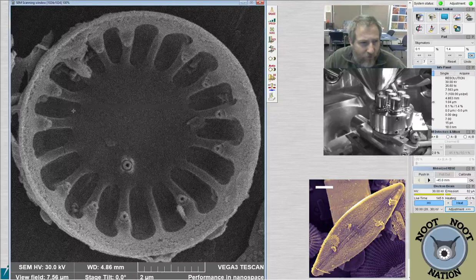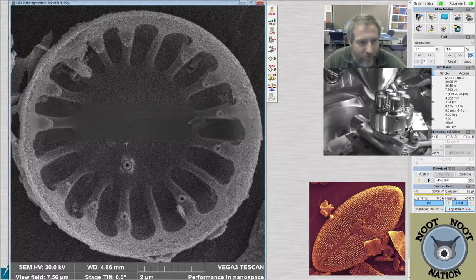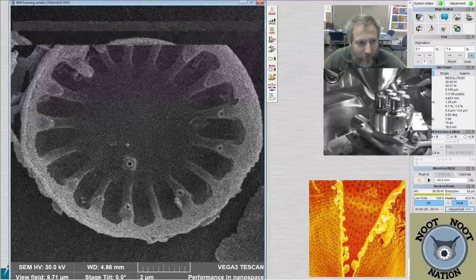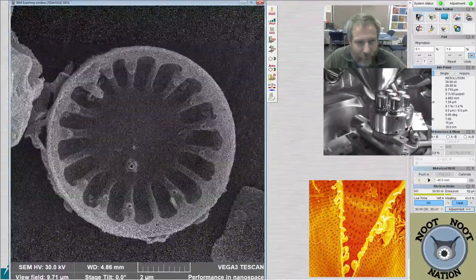But you can see all of the detail in here of the striae, these little light holes, and then these little things are called alveolar chambers. And it looks like there's a piece of junk over here that's causing me to get lines on my image, which I don't like. So I'm going to try to zoom out just a bit and see if I can get rid of the lines.